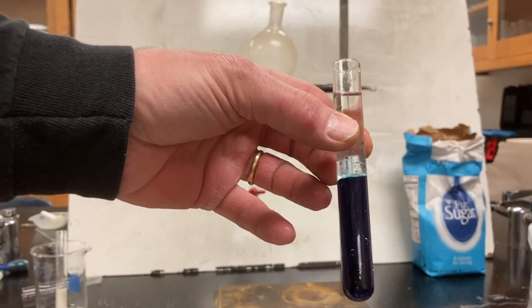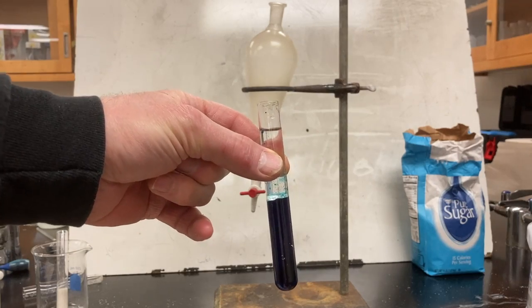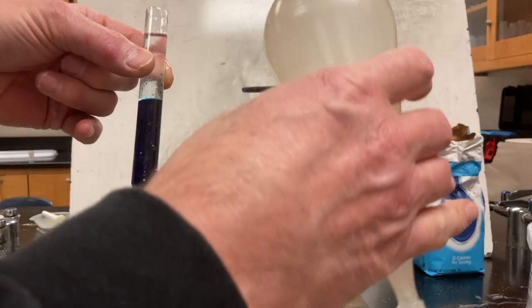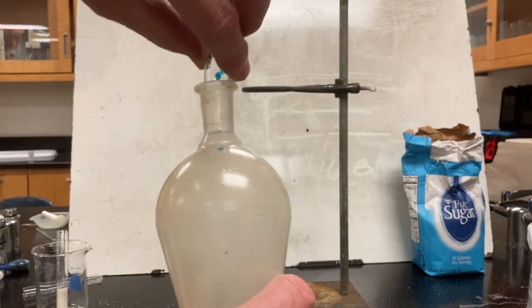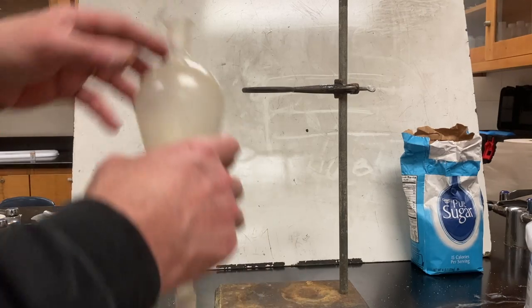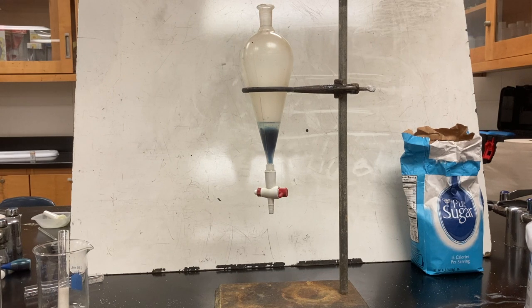Well, we said that the water and oil mixture couldn't be separated by a funnel because they're both liquids and so they would both flow through the filter paper. So here's a strategy that we can use to separate a mixture like this. Now it's a heterogeneous mixture and these two don't mix in with each other, so we can take advantage of the fact that one of them is less dense than the other one. The oil layer floats on the more dense water layer that's below.